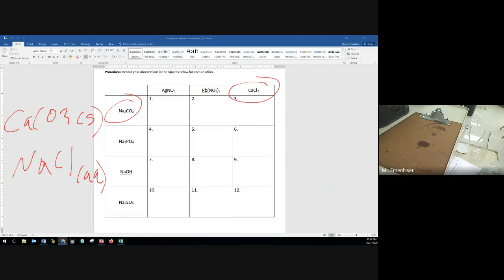calcium carbonate. And I want to mention something else that's in calcium carbonate. One of my favorite things to eat, Tums, calcium carbonate. If y'all can see it right there, calcium carbonate. So that's the active ingredient in Tums that is used to fight acid.